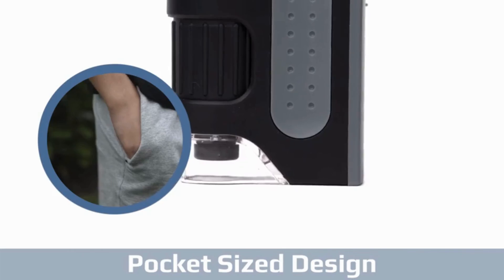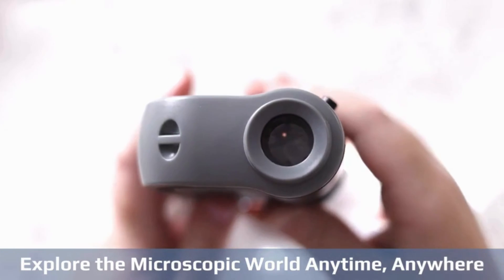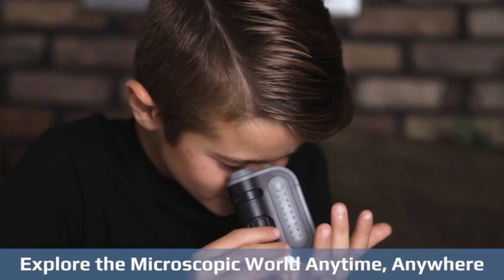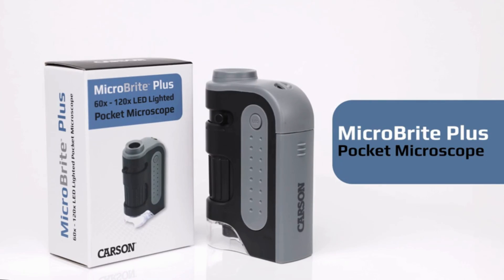Discover, learn, and explore the wonders of the natural world with the Carson Microbrite Plus LED Pocket Microscope. With up to 120x magnification and LED lighting, kids, adults, students, and professionals alike can witness the tiniest details come to life in this powerful portable tool.